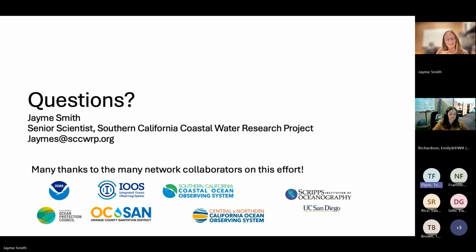One of the things that EMP comes up with, and that Tiffany and I have talked about over the years, is that we use the ship's onboard pump to take our phytoplankton samples, and sometimes we'll notice, especially with diatoms, that leads to breakage. So I was wondering with the IFCB, I'm guessing the pumps are maybe a little more gentle, but I was wondering if you had experience with that, if you'd noticed that it causes cell damage or other things, especially with more delicate organisms.